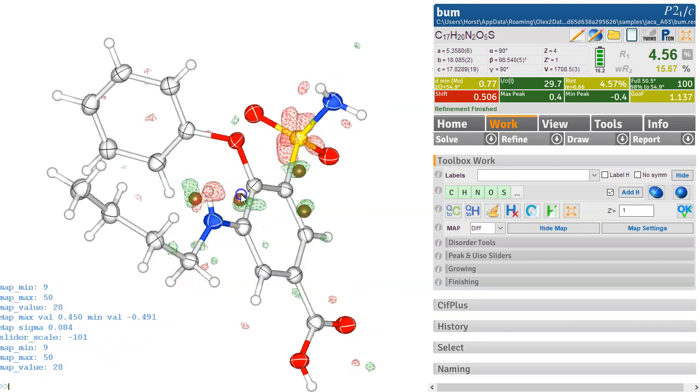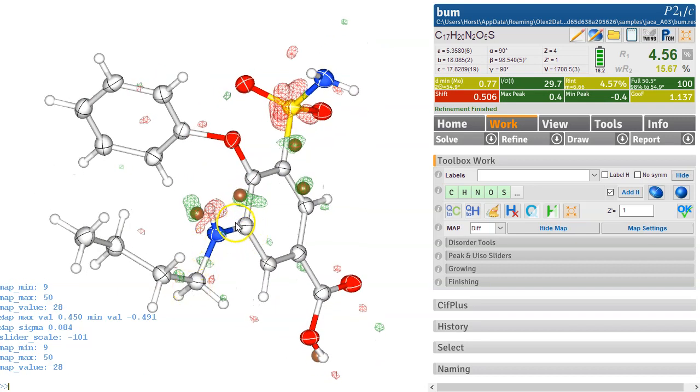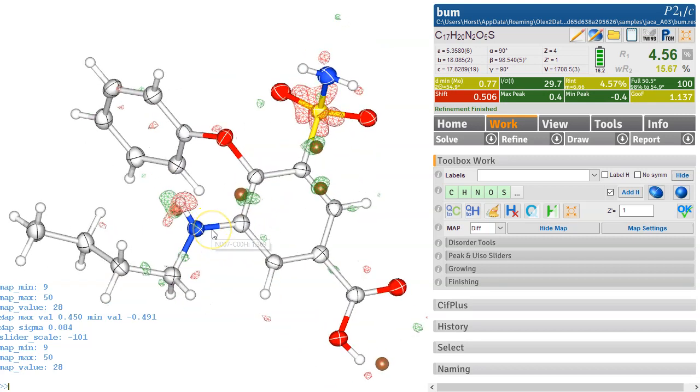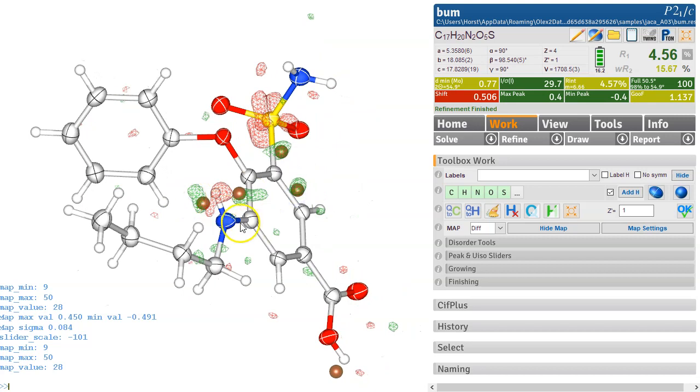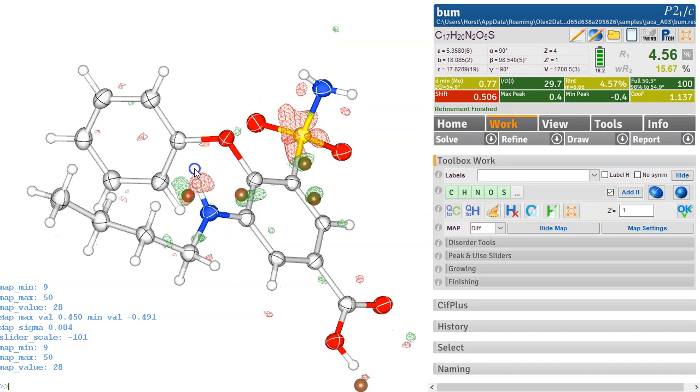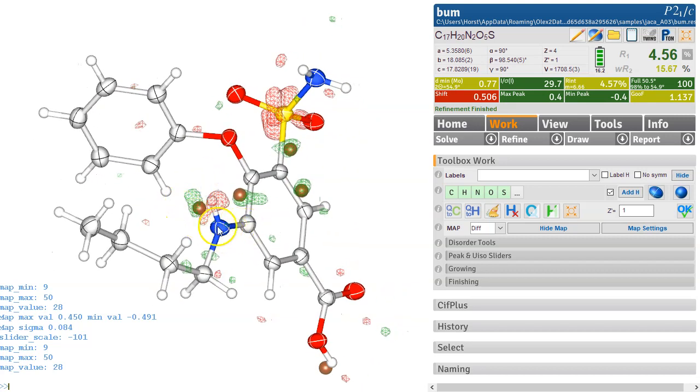Another problem, of course, is this one down here. So here, it assumed this is like an SP2 hybridized one, because that bond's quite short, but really, it's a tetrahedral amine here. So it's got the hydrogen over here, not here.